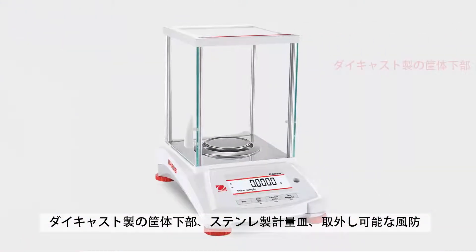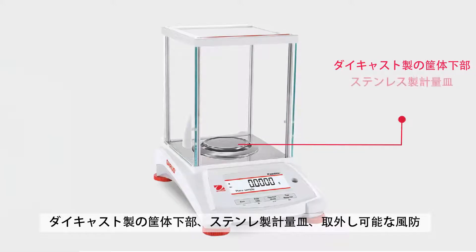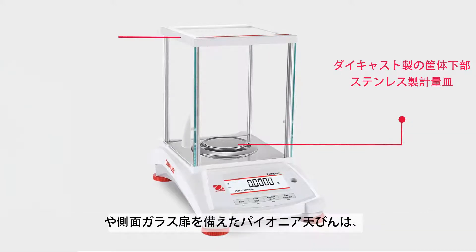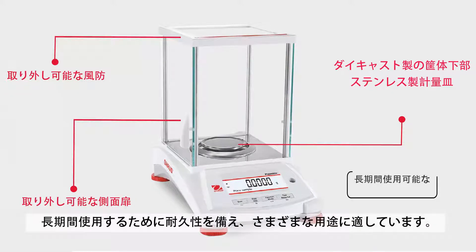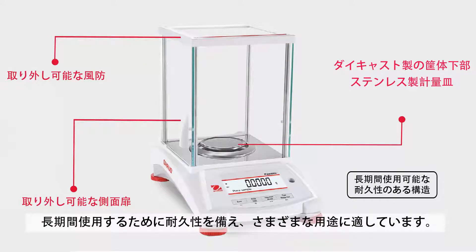Featuring a cast metal lower housing, metal sub pan, stainless steel weighing pan, and removable draft shield or side doors, the Pioneer PX is durably constructed for long-term use and suitable for a variety of applications.